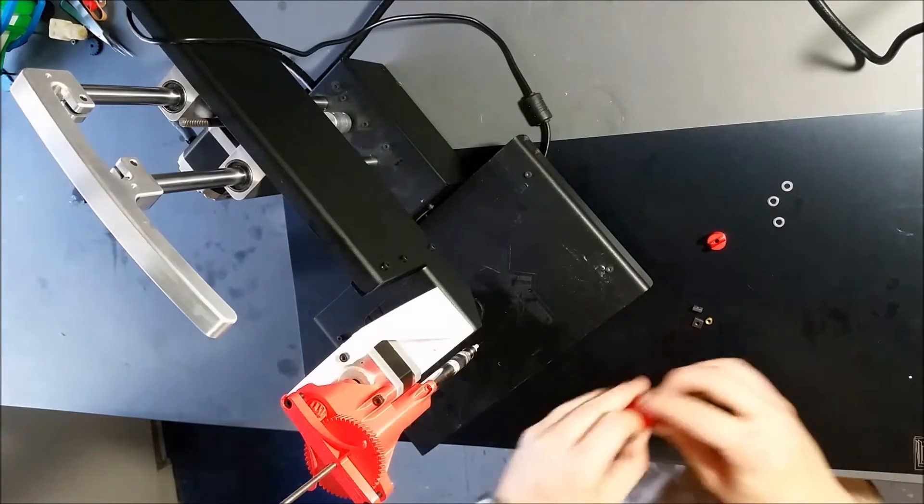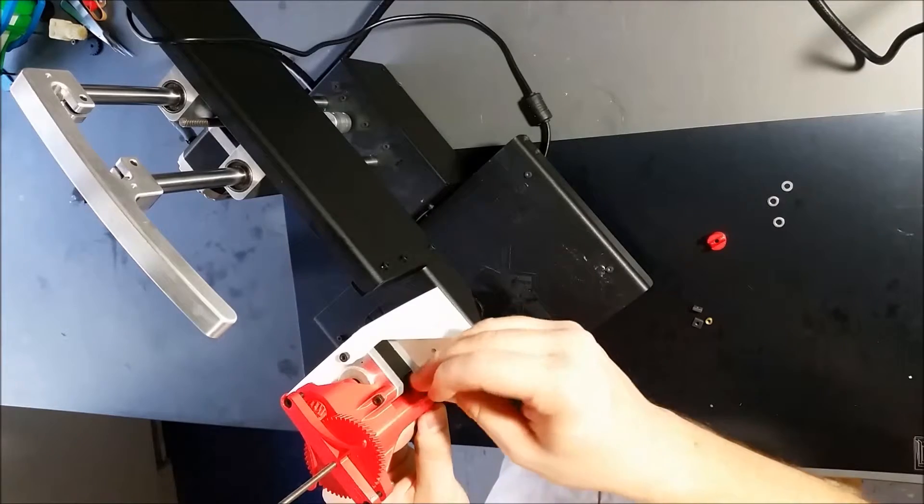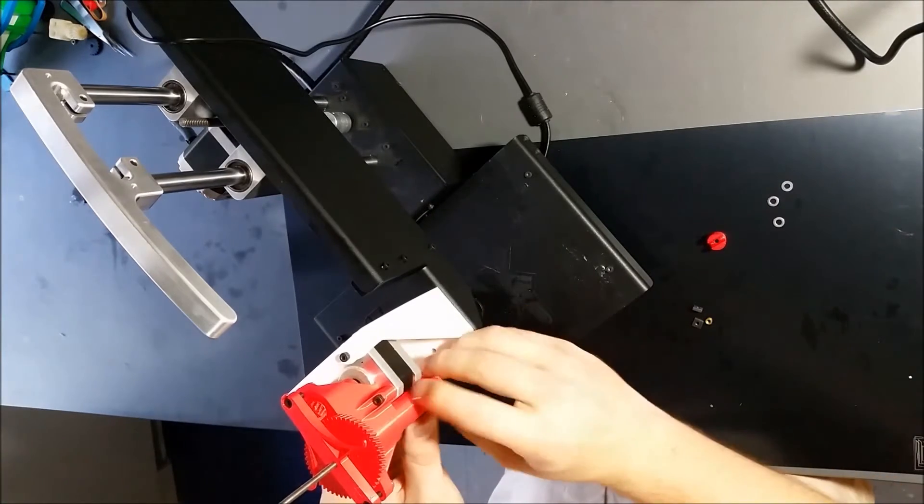Alright, so place the holder for the syringe right there, push the nuts down through the base of the Replostruder.